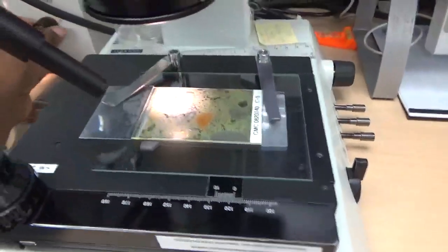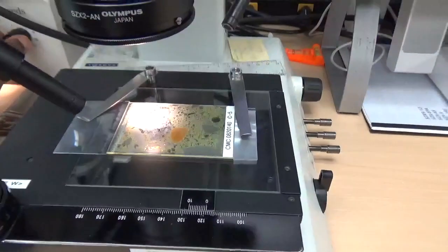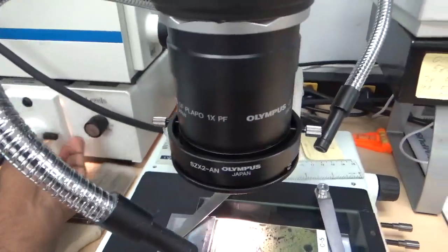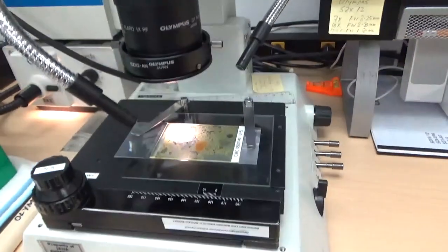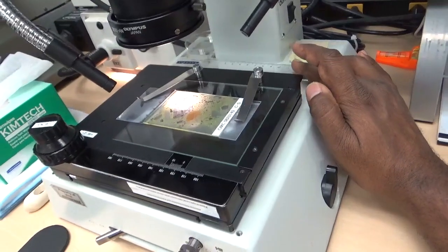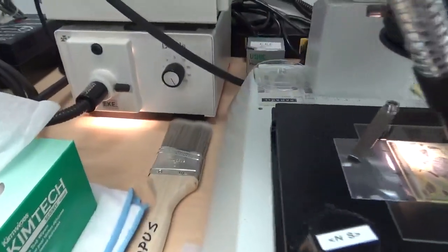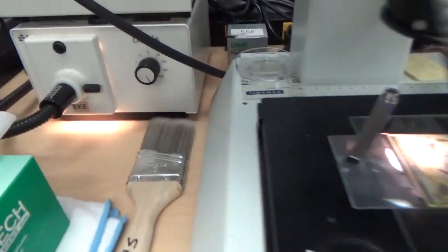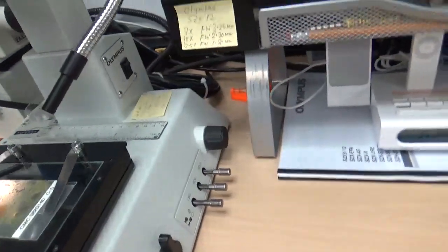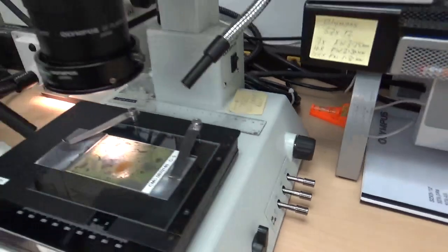Only the transmitted light. We don't need the reflected light or the fluorescent light. We just use the transmitted light at the maximum illumination. We use a fiber optic light. It's very important to get a bright light source to do the scanning of the thin section. So we use this fiber optic light with gooseneck, the Fostec gooseneck that comes on the back of the microscope.